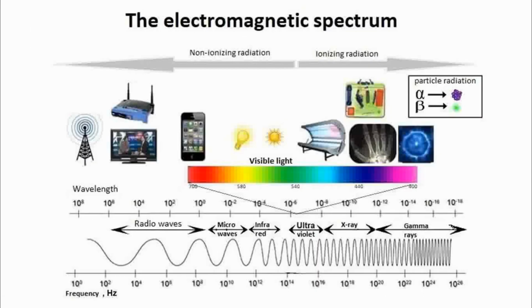Now this is the electromagnetic spectrum, and in this electromagnetic spectrum, depending on the wavelength and the energy associated, there are different areas which we discussed in a previous class. Here we will be more interested in this region, x-rays, and as you can see here, the wavelength will be smaller compared to your visible spectrum. When you talk of the visible spectrum, you have something around 400 to 700 nanometer, but x-rays are lesser than that. That means, first of all, they have more energy associated with them. Secondly, the wavelength of the x-rays will be suitable enough for this type of study. How it is suitable, I'll come to in a while. But you have to understand why specifically we are talking of x-rays, because we could have used other rays also, but x-rays are suitable for identifying this.